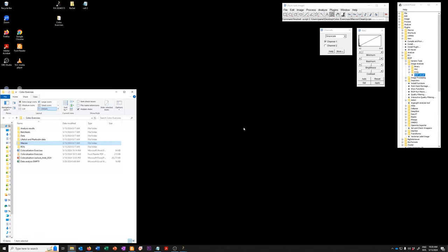I am now going to show you how to use a different thresholding method based on negative controls developed by Roman Guiet.